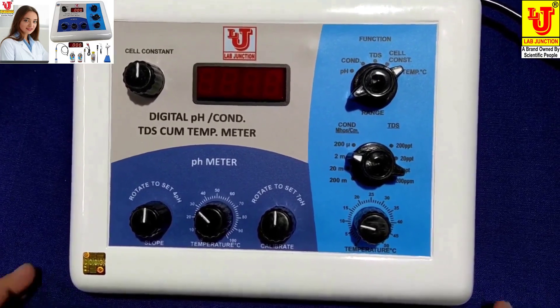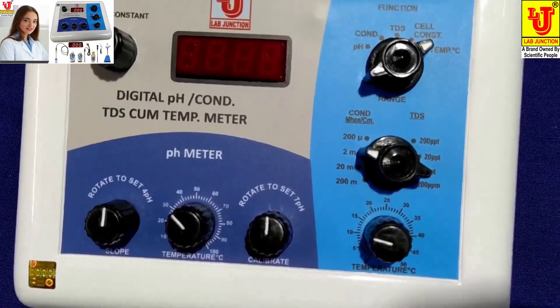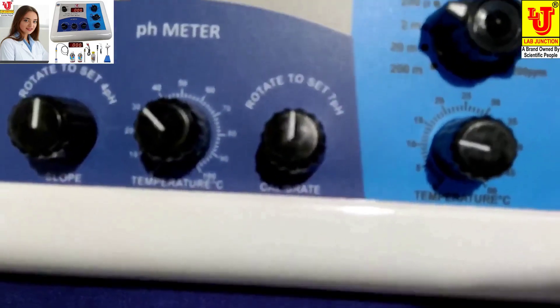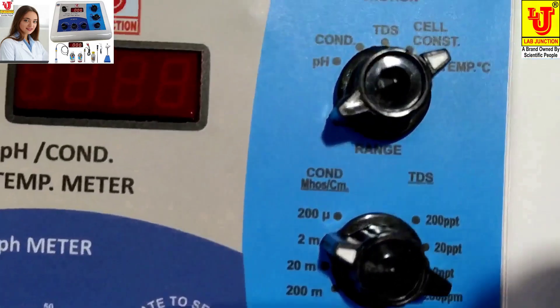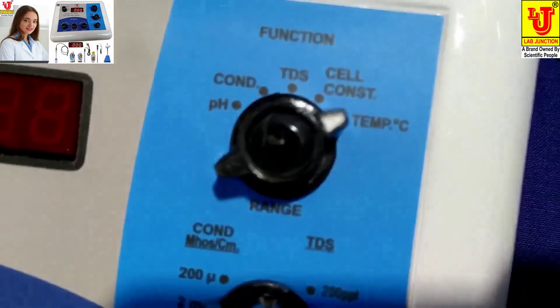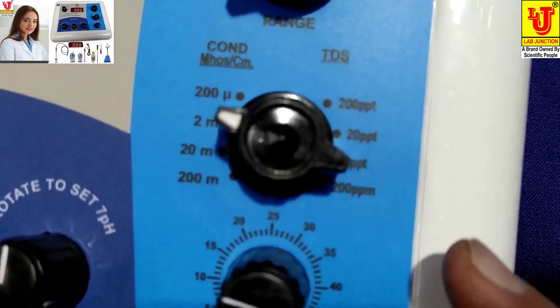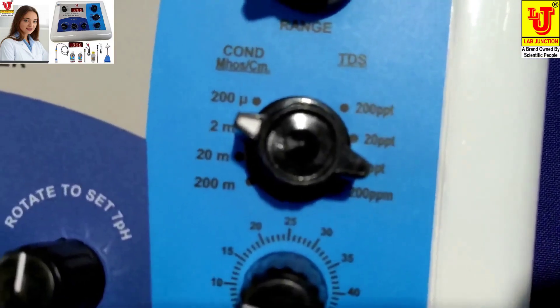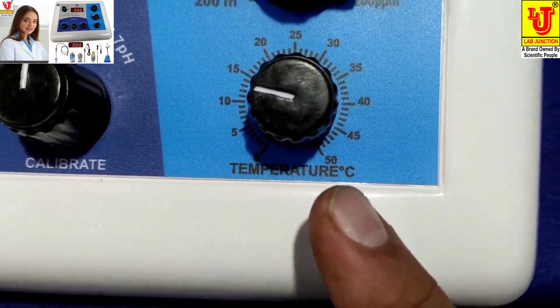This is our main instrument. This is the front view. In the front view, this is the function control for selecting parameters. Range selection is for conductivity and TDS. Temperature is also for conductivity and TDS.